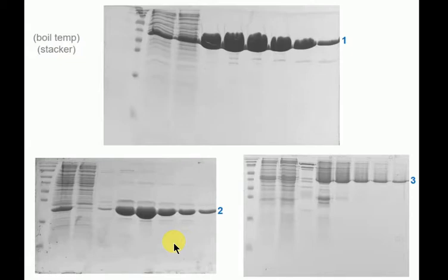Number 1, that's really pure. And even then, look, you get faint traces of other proteins present. So they could have the same characteristics as your protein, so you're not purifying them away, or they could stick to your protein. And what you should be doing is running those purification steps with an increased amount of salt so that it doesn't stick to it anymore.